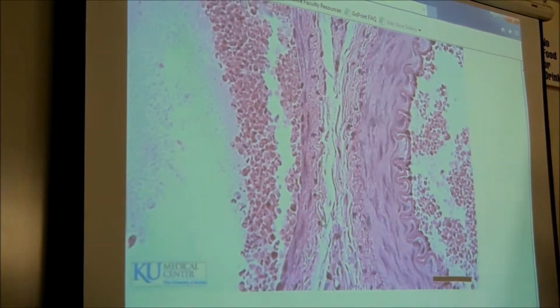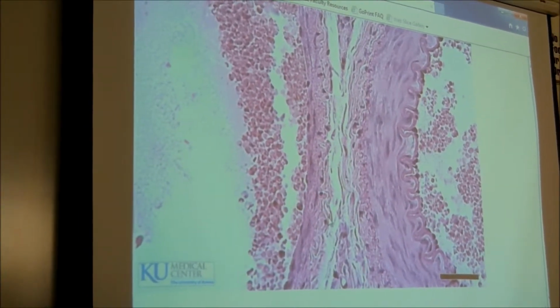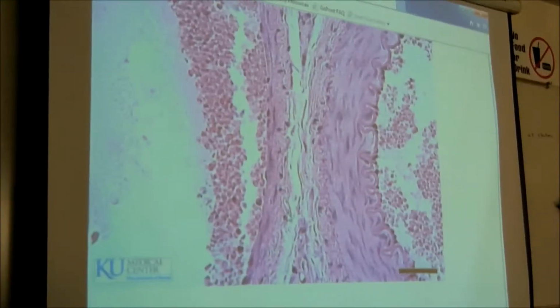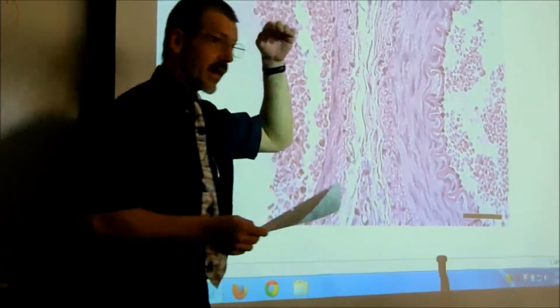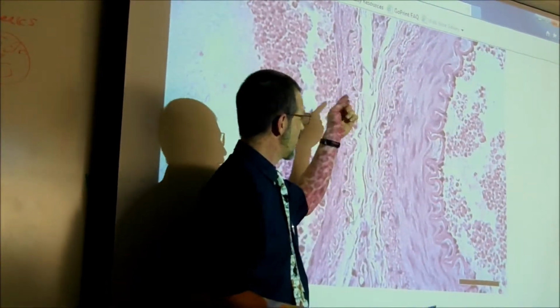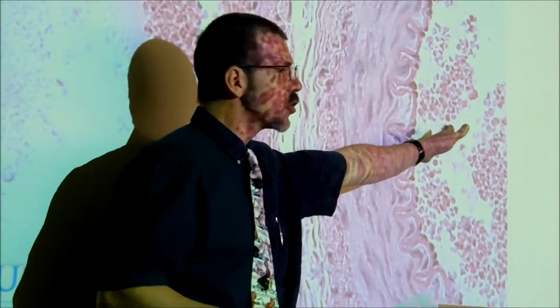That's the big question. So once you know it's an artery or a vein, then you have to go back and name the layers within those layers, basically. So if you look at your magic sheet, there's tunicas, just like the eyeball had tunics. So the easiest way to do it is start where the blood is on the inside, which is also called the lumen, because it's white. And work your way this way and look for color changes. For example, can everyone see there's a little red line out here? Okay. That would be the innermost tunic, or the tunica interna, or tunica intima. Either way is fine. I learned intima, so that tends to be what I use. But intimate or close. All right, that's the one closest to the blood, or internal.